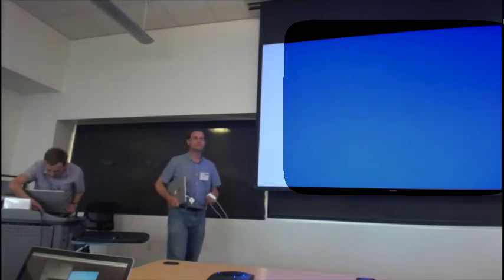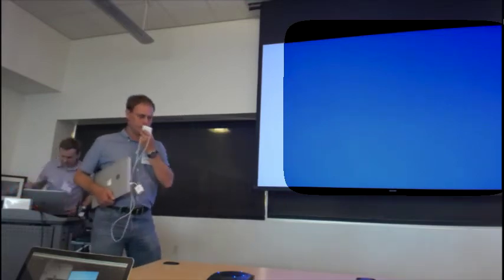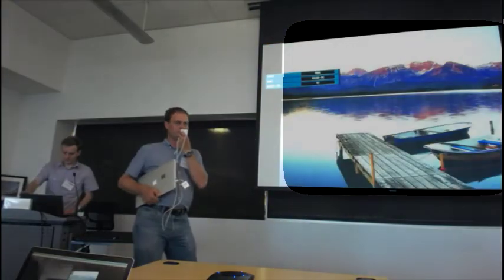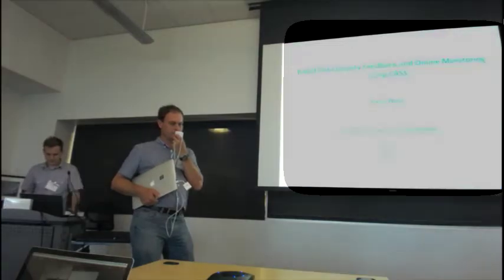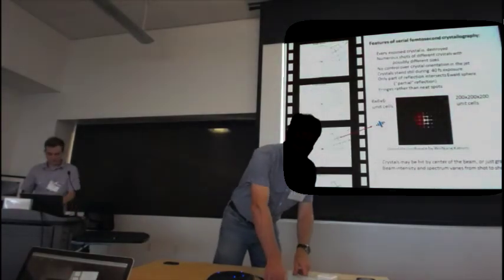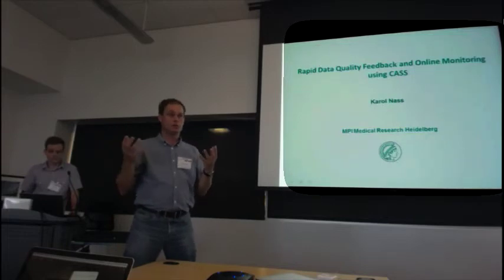What kind of corrections does Cheetah really do, in detail? Because I recently looked at the significantly positive reflections for a large data set, that was one of the tutorial ones, and you can see inhomogeneities. Everything, of course, can be turned on and off, so the answer might actually depend on which processing was applied to that data set.